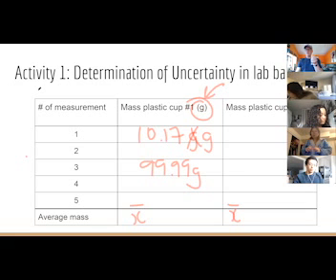And even small things like if you're not wearing gloves and you're taking the mass of the cup, what else is on the cup that you may be taking the mass of? The wax pen. What's that? The wax pen. Yes, exactly.